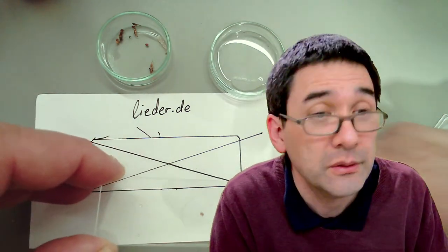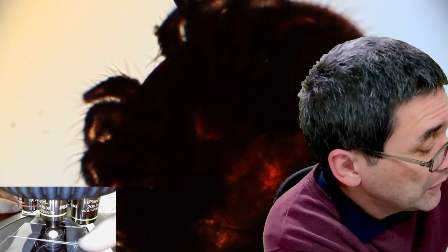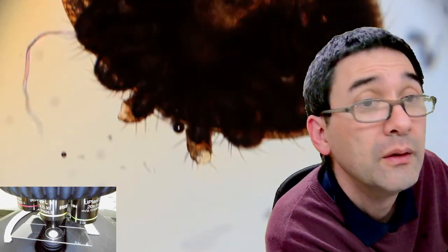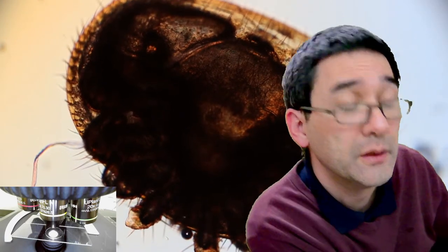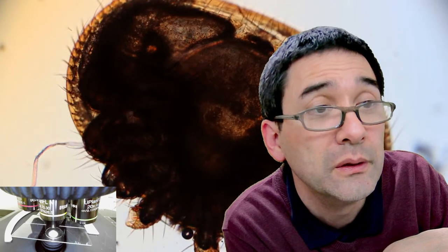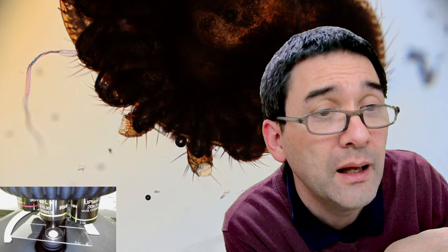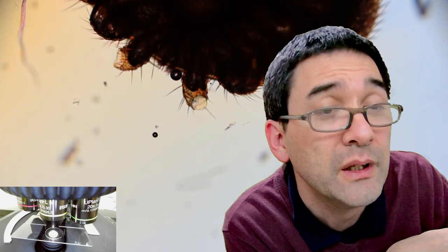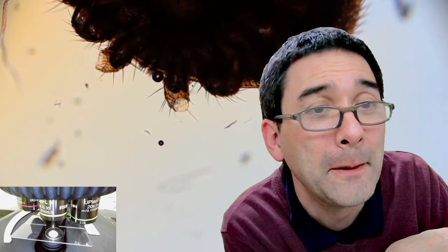I don't know. Okay, so microscope scene. So that is the first one. And over here, I've got the other one. Oh. It does look a little bit more clear, but I don't know if this is because of the soap. But again, there's a tiny bubble here. Ah, look, there are some bubbles floating around. Kind of shows that the thing is still liquid.